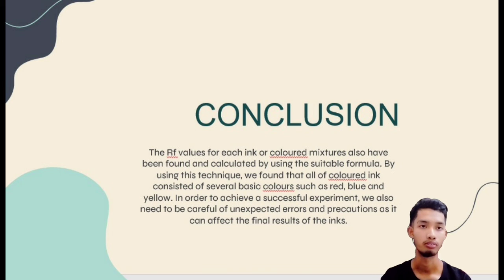The Rf values for each ink or colored mixture have also been found and calculated by using the suitable formula. By using this technique, we found that all of the colored ink consisted of several basic colors such as red, blue, and yellow.